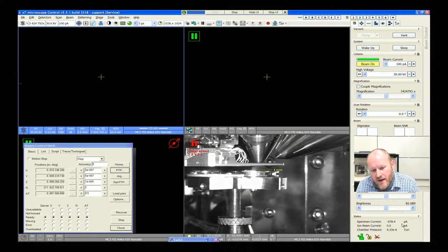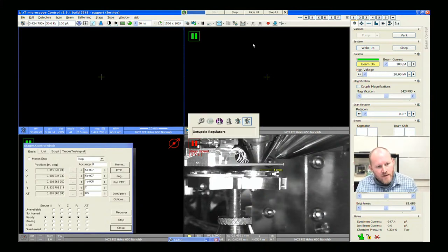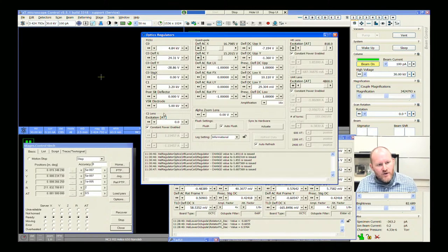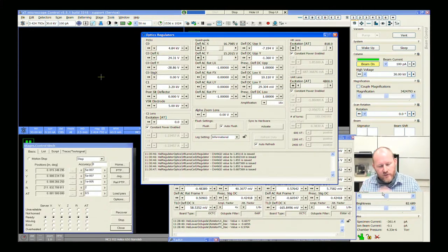The specimen current right now — let me just speed up scanning — we're around 360 picoamps, even though our beam setting says 100 picoamp. If you remember, what we've done is turned off the C2 lens — this value is a function of the C2 lens and normal lookup table settings. We've turned the C2 off and we've also retracted an aperture. So this is the beam current: we're getting about 360 picoamps.